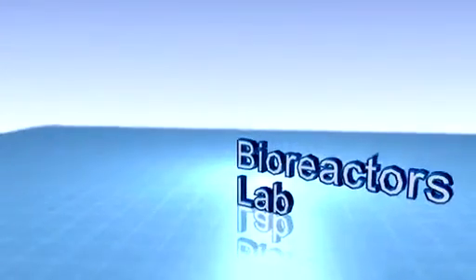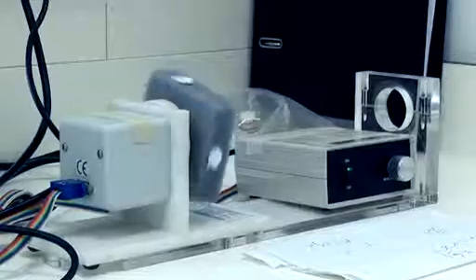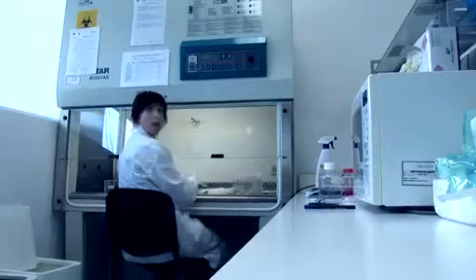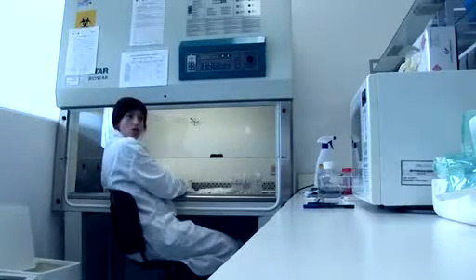The Bioreactors Laboratory is a facility specifically devoted to the development and functionality assessment of advanced culturing systems. That is, systems that have the potential to enhance the functionality of tissue-engineered constructs as compared to the standard static culturing methodologies. We are in the Bioreactors Lab, where we develop advanced culturing system in order to obtain tissue-engineered constructs with high functionality.